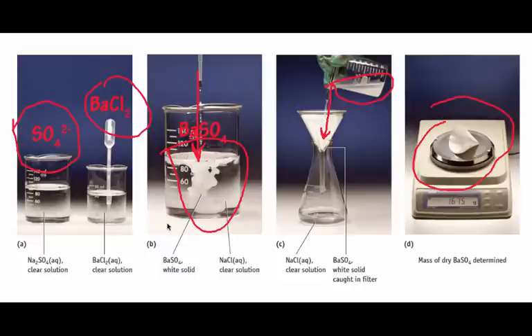Once that's dried, we'll weigh it on a milligram balance. And in this case, we see that the mass of the dry barium sulfate and the filter paper is 1.675 grams.